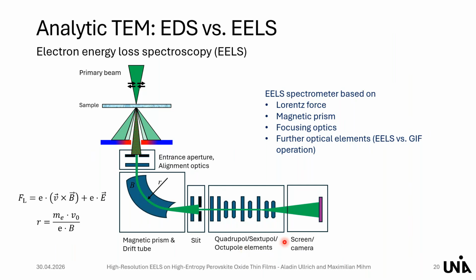Depending on the settings and on the equipment you have, you can operate it in the pure spectrometer mode, so that you just get a spectrum. And if you're lucky and you have some imaging filters, so some more optics, then you can also filter a full TEM image and project it on your camera. But this is not what we have here and what we used. We used just a pure spectrometer.